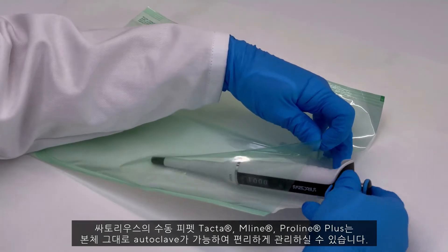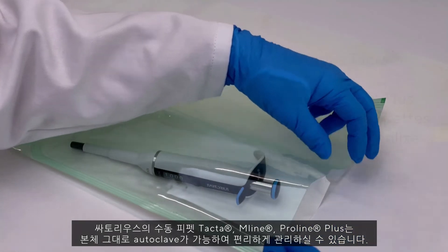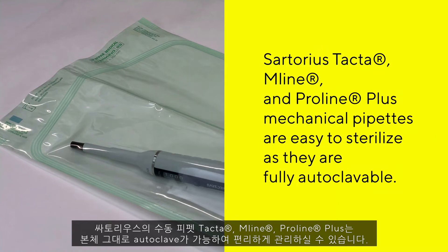Sartorius Tacta, M-Line, and Pro-Line Plus mechanical pipettes are easy to sterilize as they are fully autoclavable.